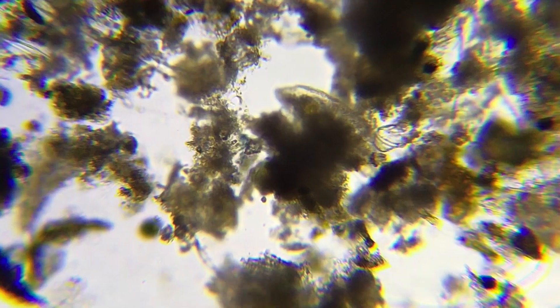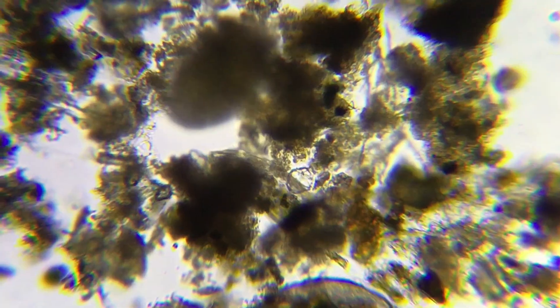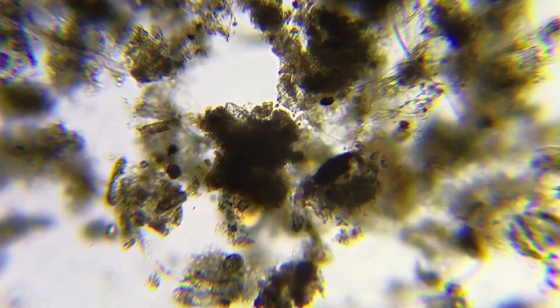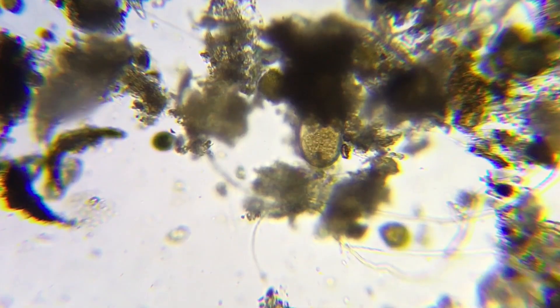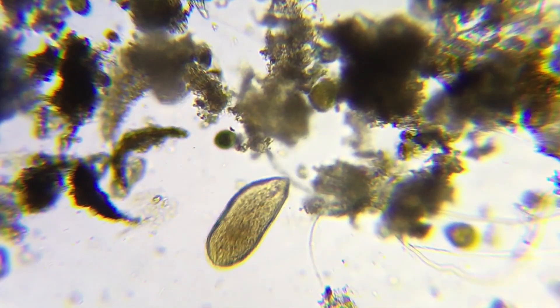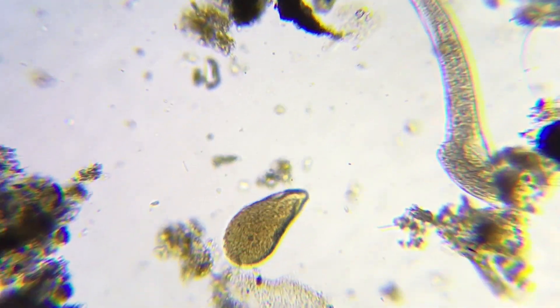Is that another one of those? Is that a natural ornata? Is that a flatworm? What's happening here? There's so much stuff everywhere. There's an acorn up there. Ooh, a leg, a leg!